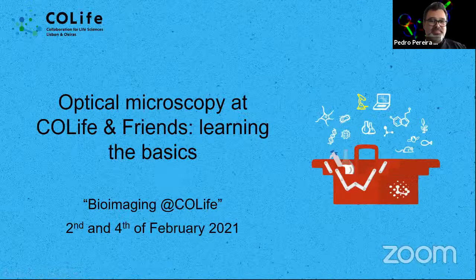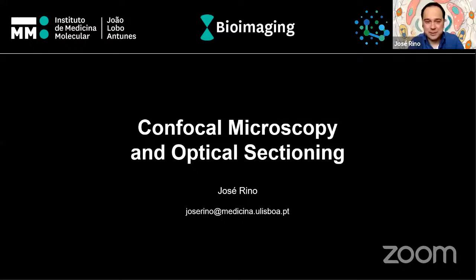All right. Let's go for the final lecture of today. Good morning, everybody, or good afternoon, maybe. So I'm going to talk to you about confocal microscopy and optical sectioning and how we can use it to acquire 3D images of your samples.